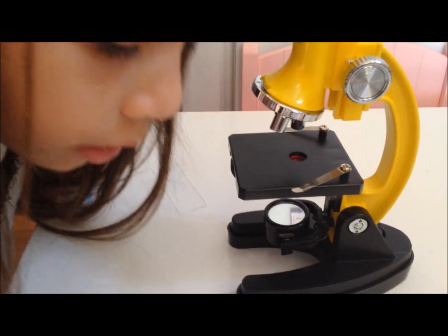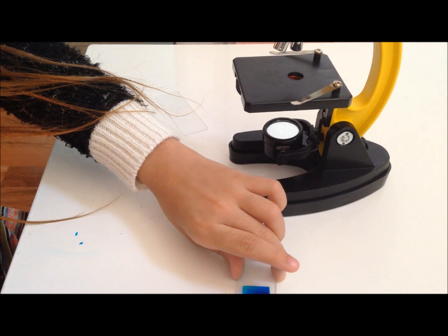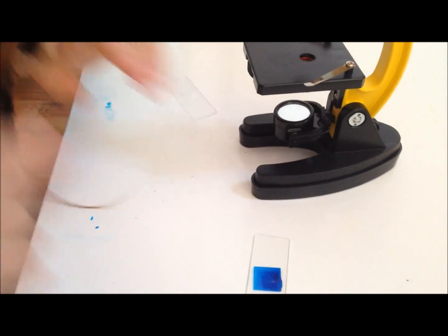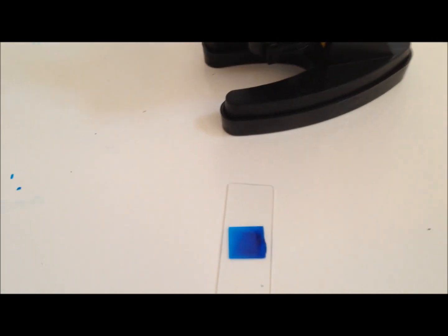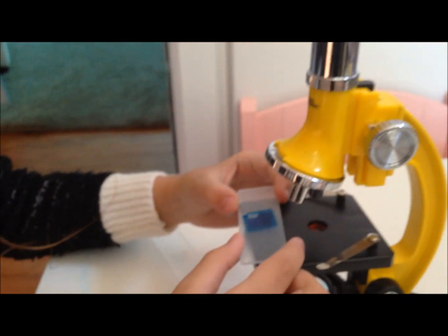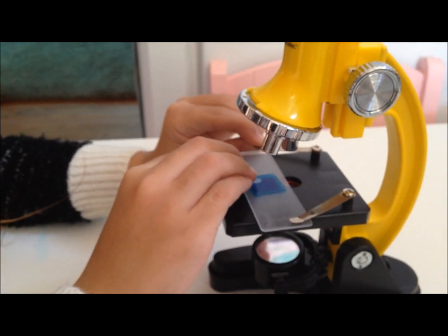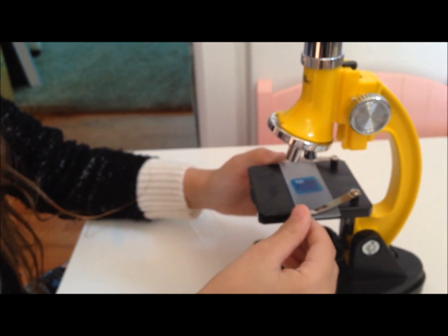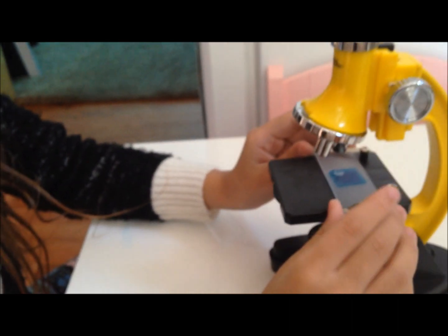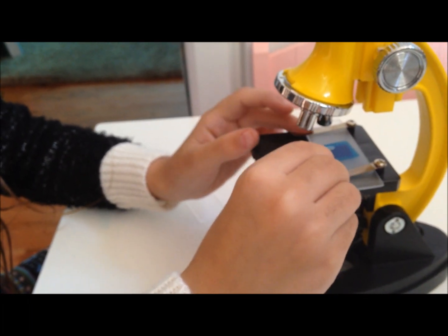It's time to turn it on. Turn on the microscope. I'm just going to leave some — I'll clean that up for you. The excess one — go get a paper towel. This is what it looks like. We clean the excess, and now we take this and put it right under here. Very gently. Gently do that. Put it in place, all the way down and slap that thing.